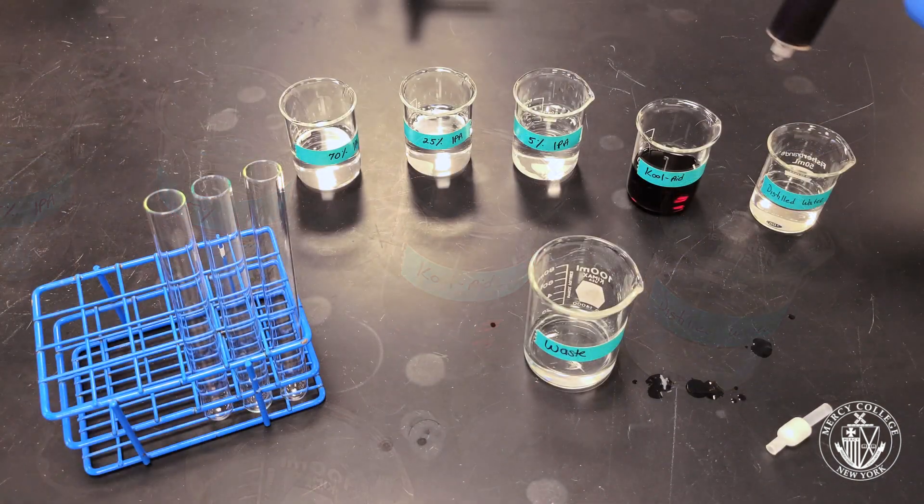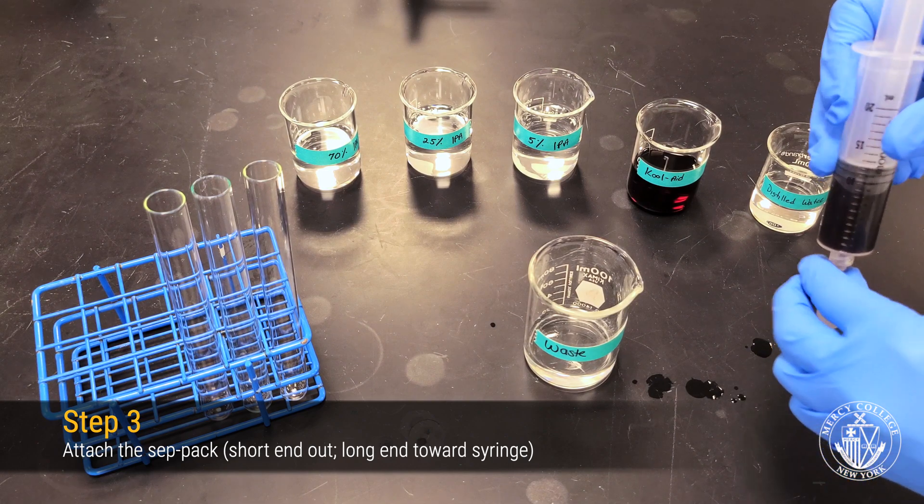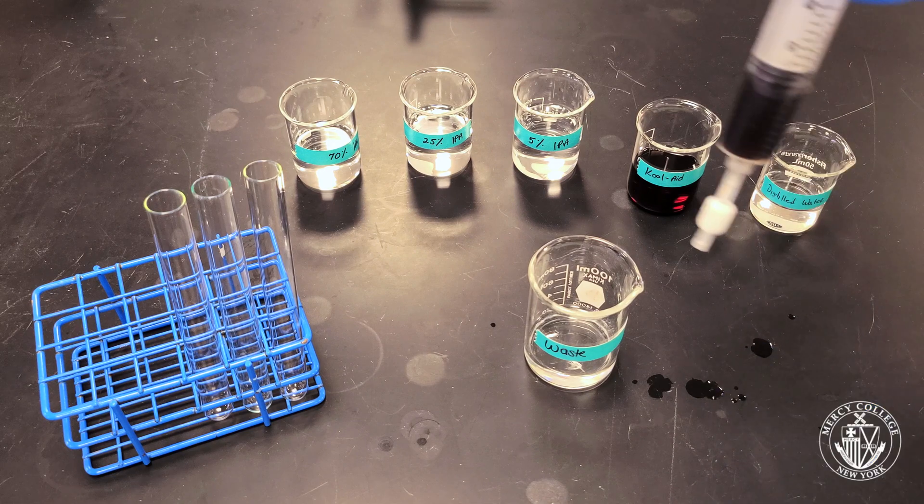After filling your syringe, reattach the CEPPAC cartridge. Next, we're going to slowly push our grape Kool-Aid solution through our CEPPAC cartridge in order to load the column.